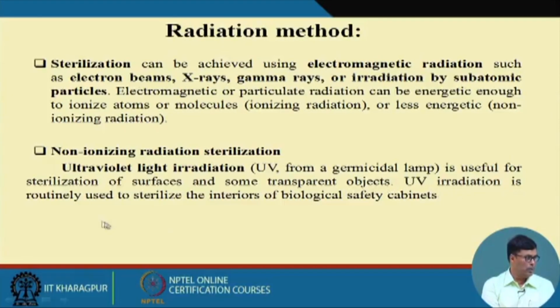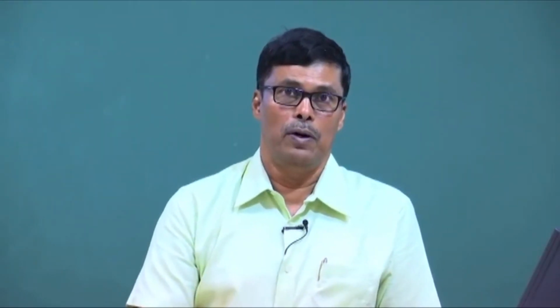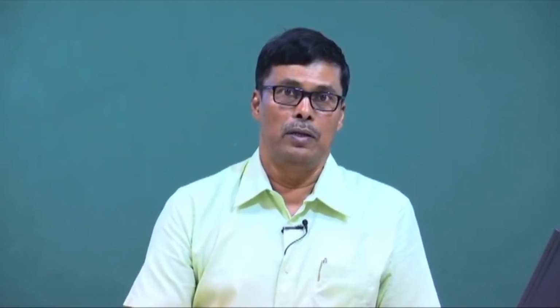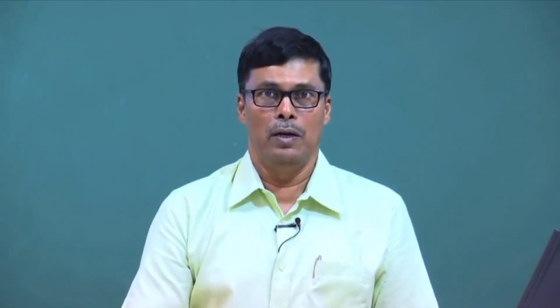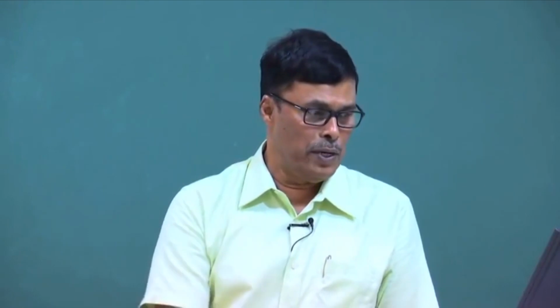UV irradiation is routinely used to sterilize the interior of biological safety cabinets. In the operation theater also we use UV rays for surface sterilization. In the biochemical industry also we have a laminar flow chamber where we prepare our culture, and the inside of the chamber we usually sterilize with the help of UV rays.